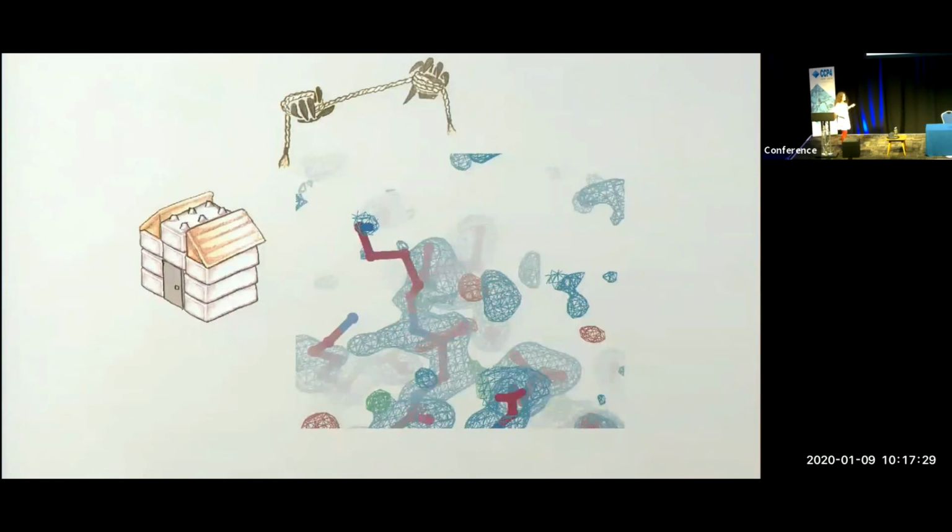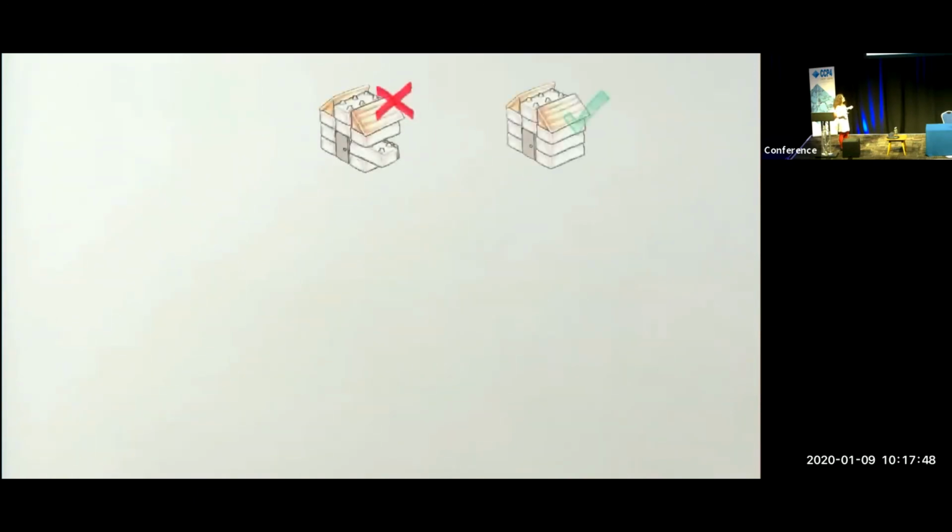And I'm going to show you now some numerical analysis of the various maps and models that you can create. So what I'm going to do is show you a correlation coefficient of that little backbone region there in real space. And we're going to compare the two models, uncorrected and corrected. And we're going to compare them to maps from the refinement of either of those models. So we're either going to use a map where the input model is the uncorrected model or the corrected model. And so I'll show you the results for the two kinds of refinement programs.